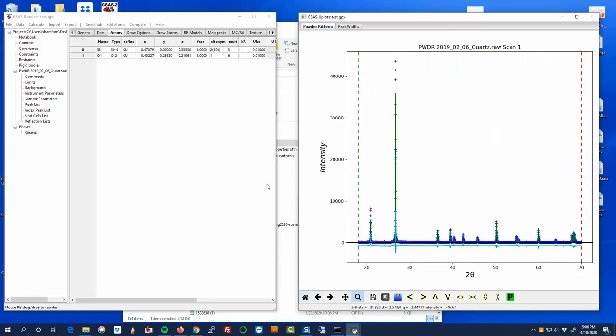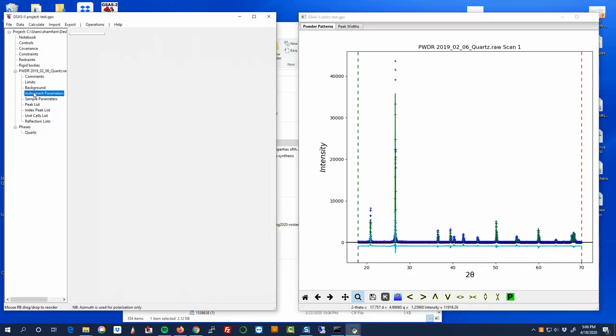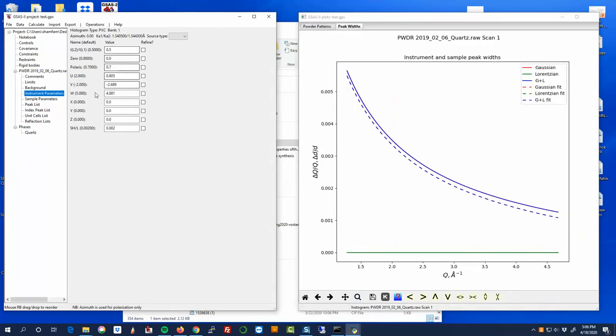So we're going to call it good for now. That is an example of how you can work through your first refinement. And I would recommend that you do this with the quartz data that has been provided. And the thing that you can do is once you've done this with this reference data, you can take your instrument parameters here and you can use this as your new starting point. And so that's going to be a little bit closer to the peak shapes that you would expect to see for some other unknown sample that's run on that same diffractometer system.